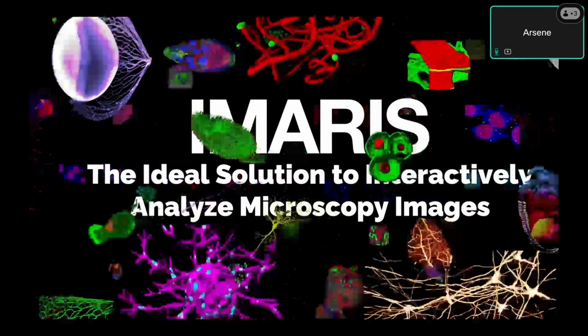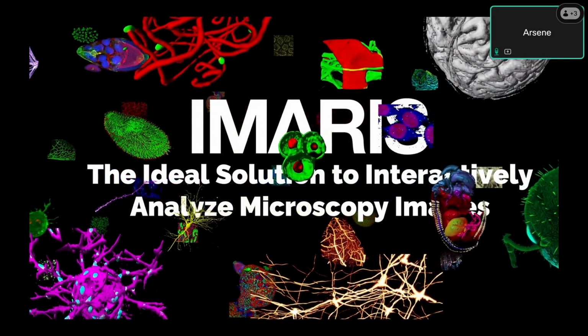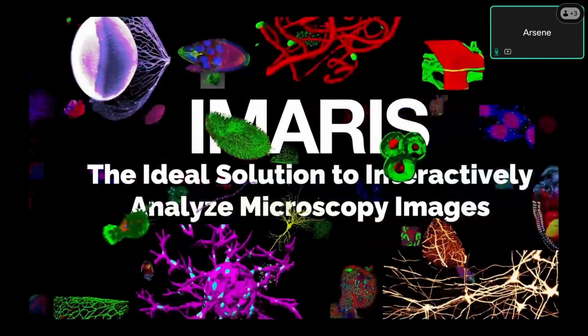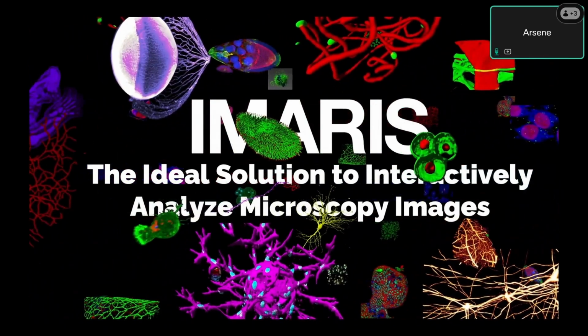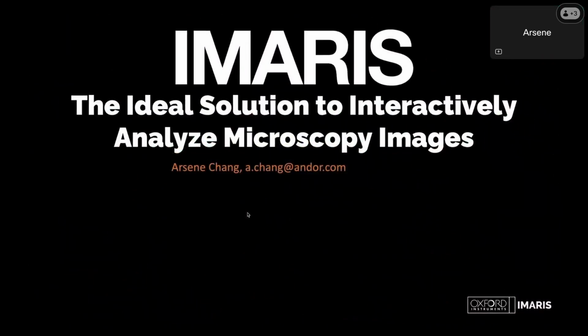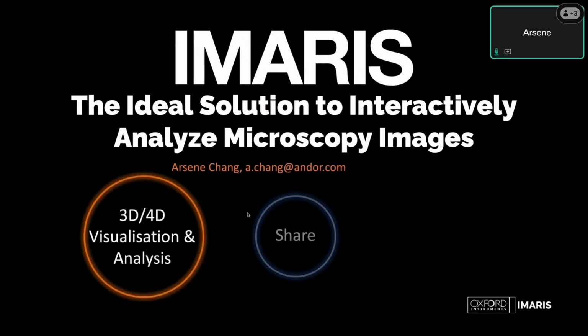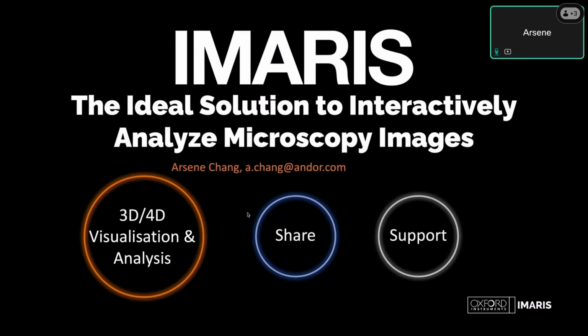Today, I want to introduce the IMARIS software, which is the ideal solution to interactively analyze microscopy images for you. So, what is IMARIS? IMARIS is a software specialized for 3D and 4D image visualization and the quantification of microscopy images.